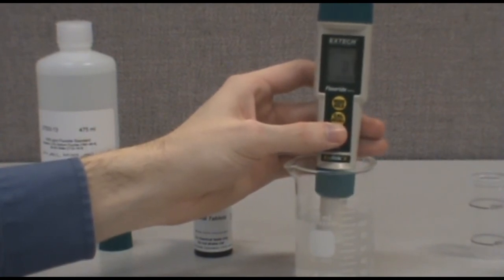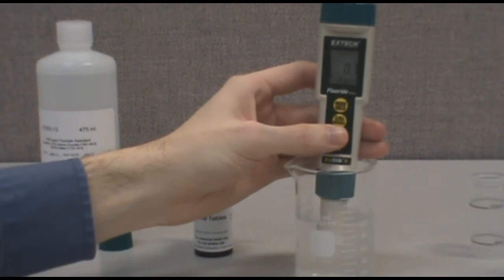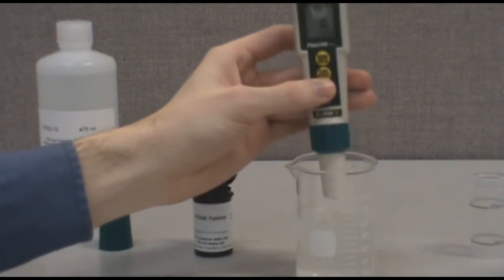The meter can be stored wet or dry. It is recommended that it be stored wet in the last solution used. If stored dry, it will be necessary to soak the meter in fluoride solution for 15 minutes before its next use.